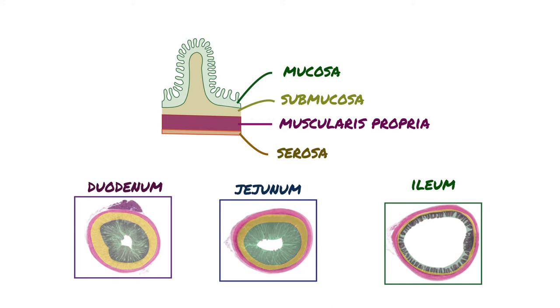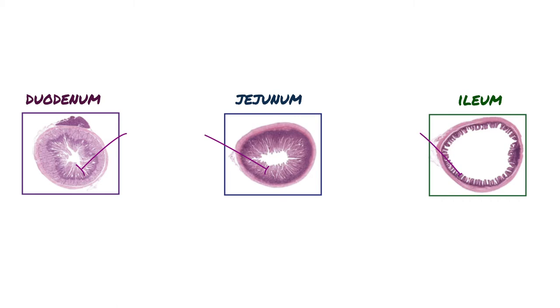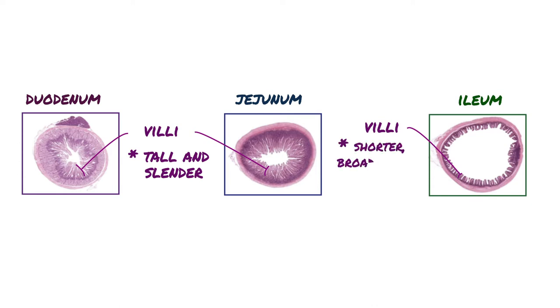Although each segment of the small intestine shares similar overall structures, there are still quite a few differences between each segment that can be seen with light microscopy. Even at low magnification, we can see that the finger-like projections, or villi, that extend into the lumen in both the duodenum and jejunum are very tall and slender when compared to the villi of the ileum, which are significantly shorter, broader, and flat-tipped.